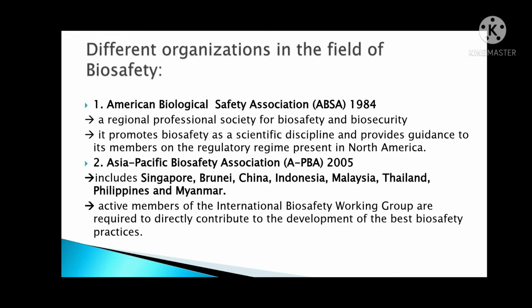The concept of biological safety or biosafety has paralleled the development of the science of microbiology and its extension into new and related areas including tissue culture, recombinant DNA, animal studies, molecular biology, synthetic biology, and biotechnology.